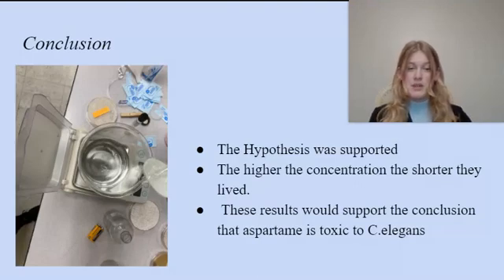The results would support the conclusion that aspartame is toxic to C. elegans, and the toxicity is directly proportional to the concentration of aspartame. For the first 6 days, the total number of worms was similar in the groups, suggesting that there was not much effect on reproduction rate.